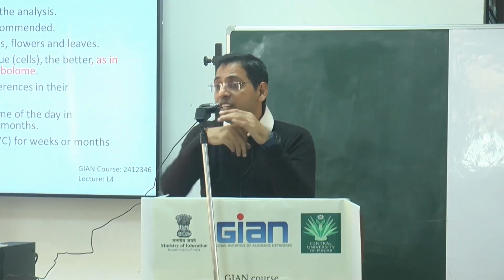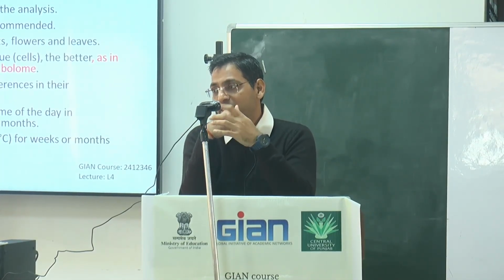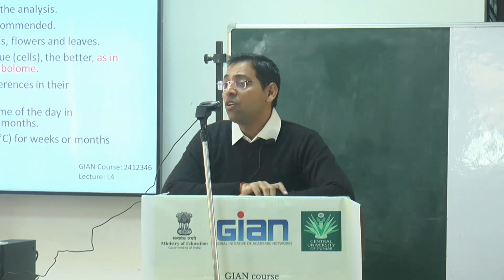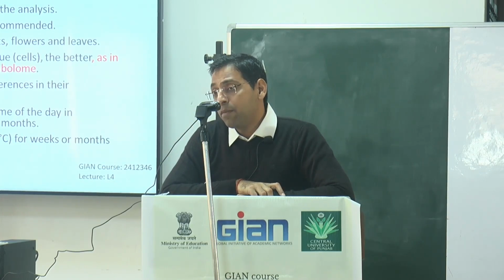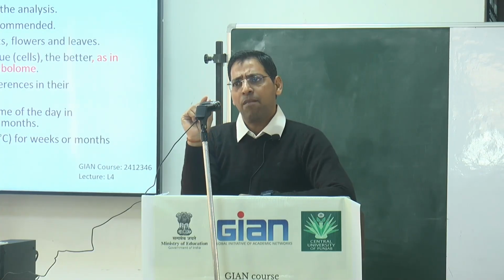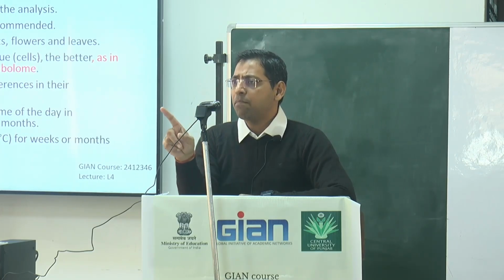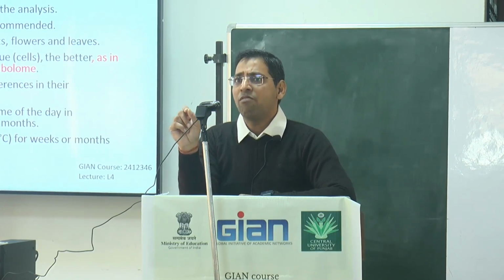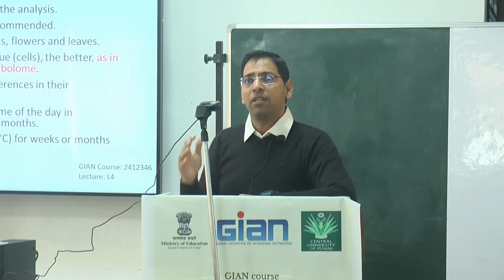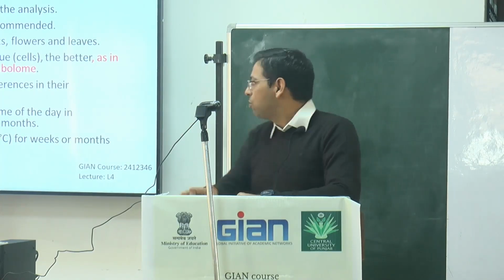The cells present just below the skin can also get some exchange of gases from the dead skin. So you have to try to understand, if you are working on embryo cells, you have to remove all the cotyledon parts and focus only on the embryo for extraction purposes. Homogeneity of the sample is more important if you have very little sample, because a more homogeneous cell population means you are able to capture biological variations with great accuracy. So you have to take care of these things.